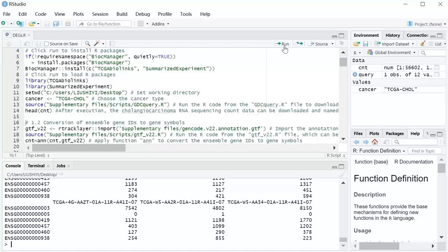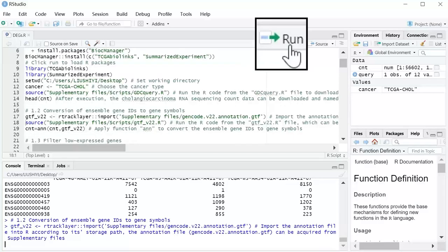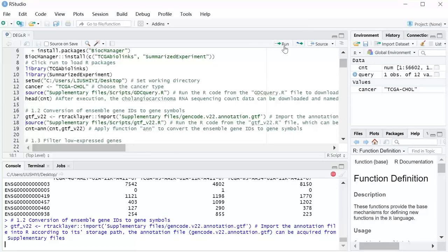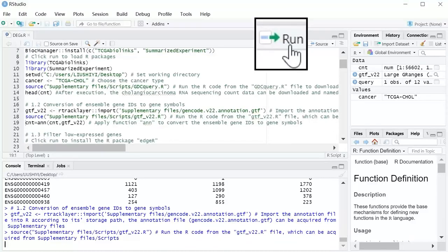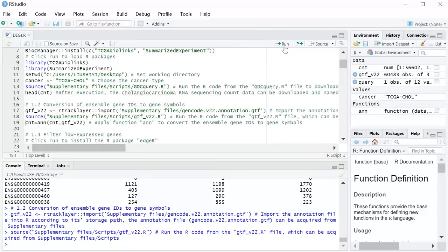Section 1.2: Conversion of Ensemble Gene IDs to Gene Symbols. Import the annotation file into R according to its storage path. The annotation file can be acquired from supplementary files. Run the R code from the GTF v22 file, which can be acquired from supplementary files.